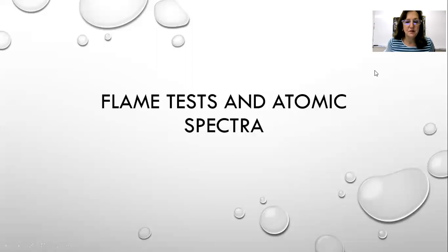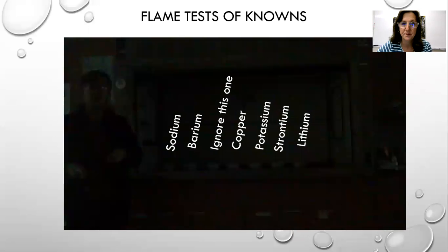Hello and welcome to Flame Tests and Atomic Spectra. This video will take you through what you would have been doing in lab, but we're going to do this in a distance way, so bear with me. It's a little hard to see some colors, but I'll try and talk you through it.